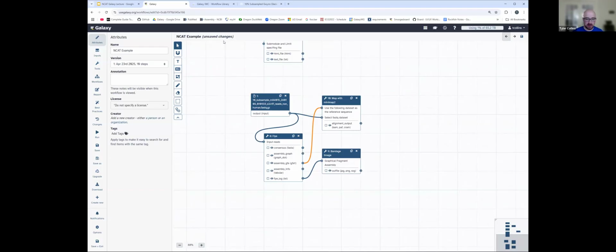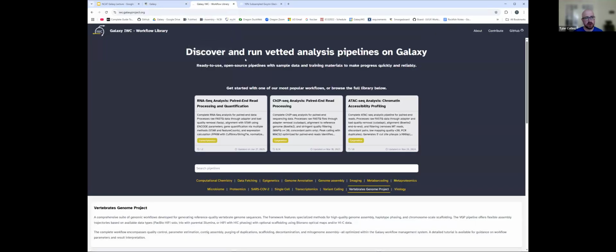And with that, I also wanted to spend maybe the last 4 minutes before we do questions and things for as long as you guys would like on the IWC. Very often, the best way to get a good idea of workflows is to use ones that are highly vetted, curated, and tested. And so one of the new things that we've been adding is we've had the IWC workflows for a little while. There's a whole repository, but we've been implementing a much nicer site to be able to access them, explore them, and find them. And so I want to spend like 1 minute kind of showing it off.